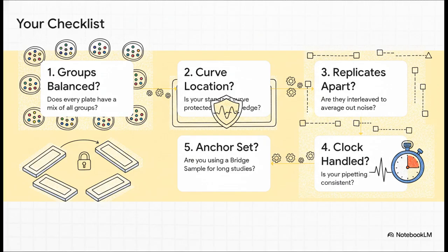4, how am I handling the clock? Am I keeping my timing and rhythm consistent? And number 5, this is for you long-term study folks, do I have an anchor, like a bridge sample, to tie all my plates together over time?